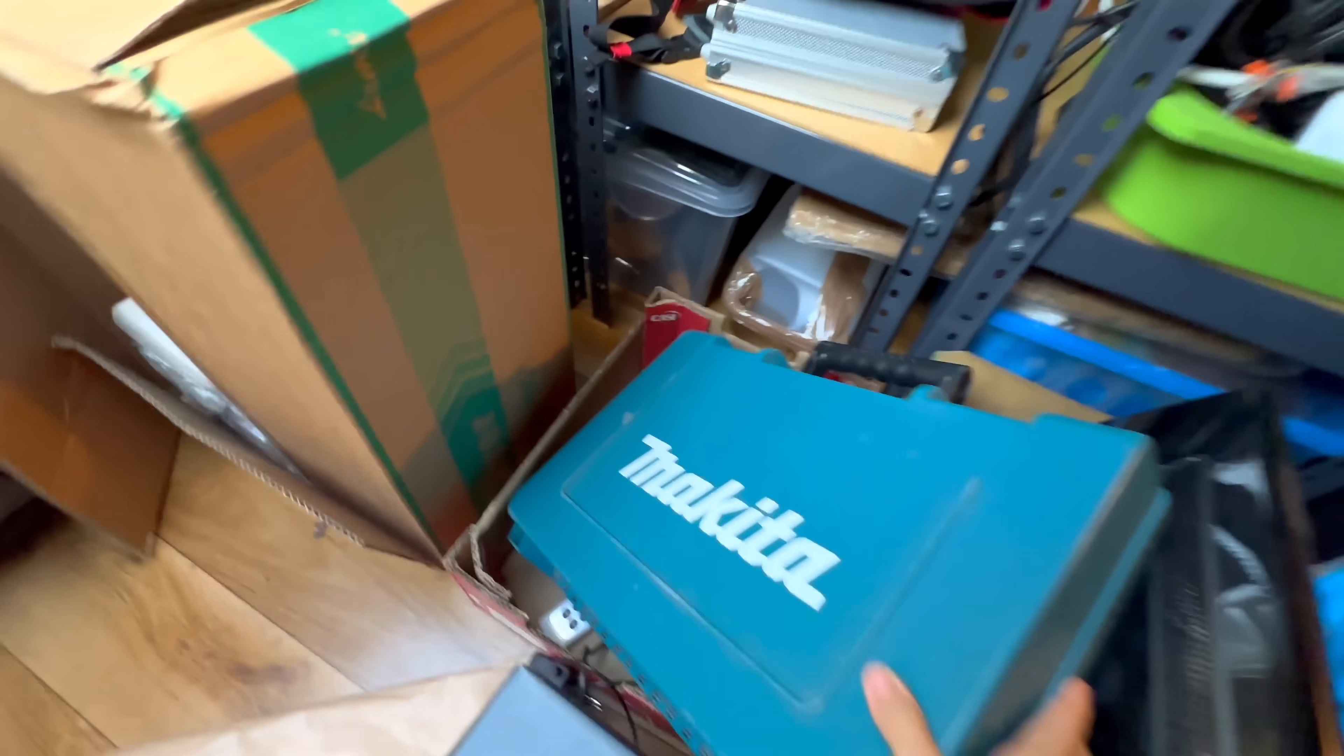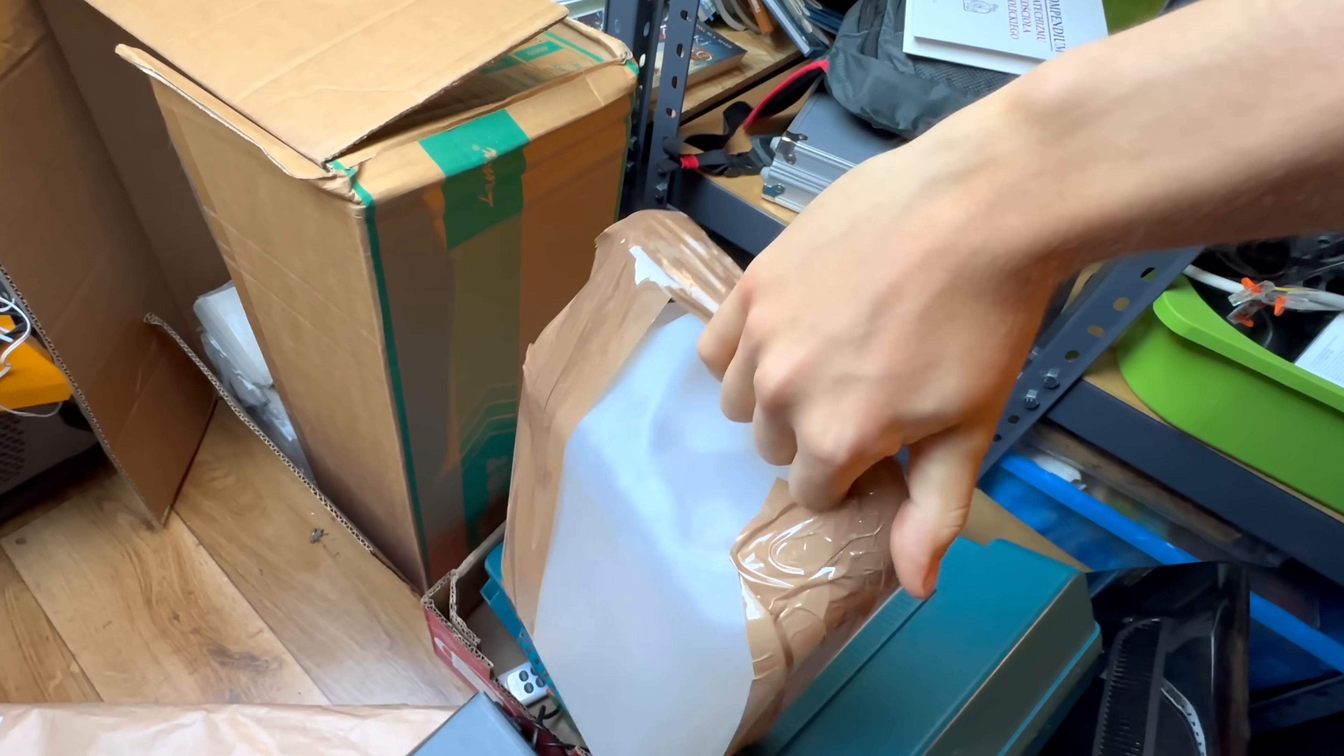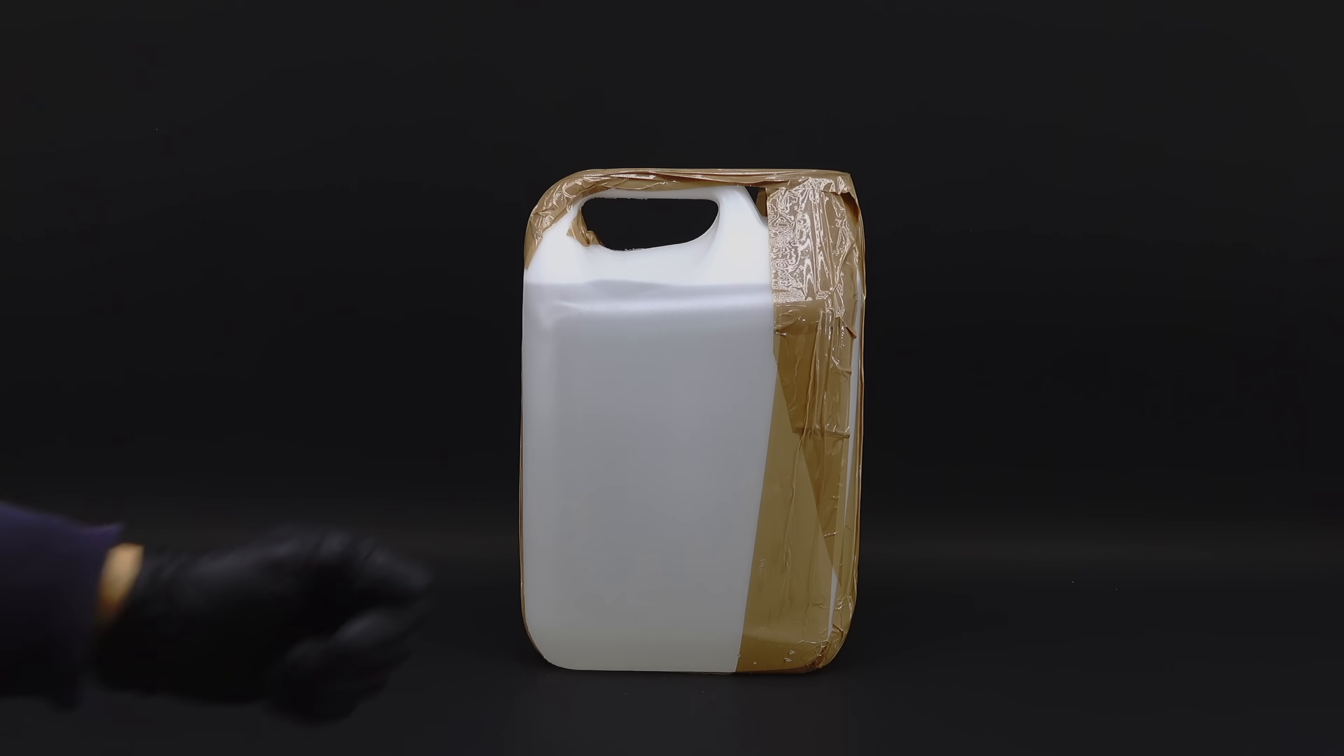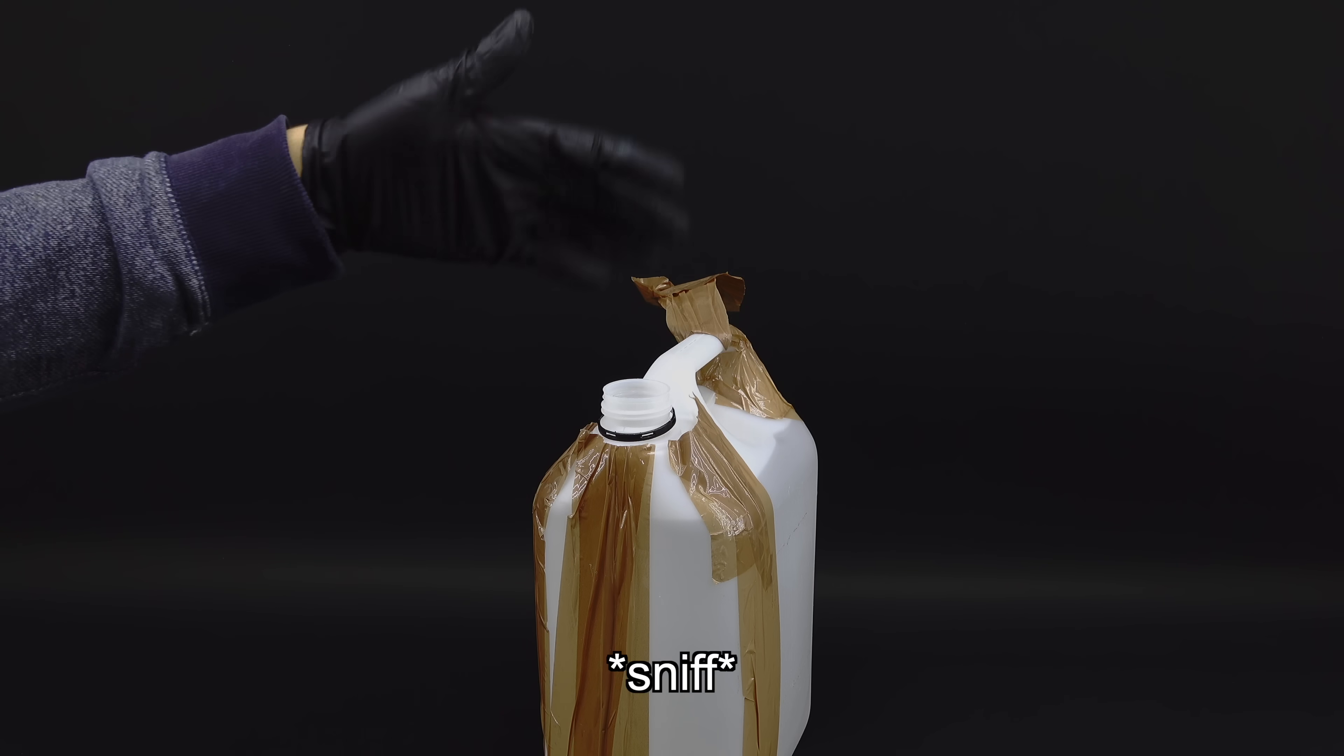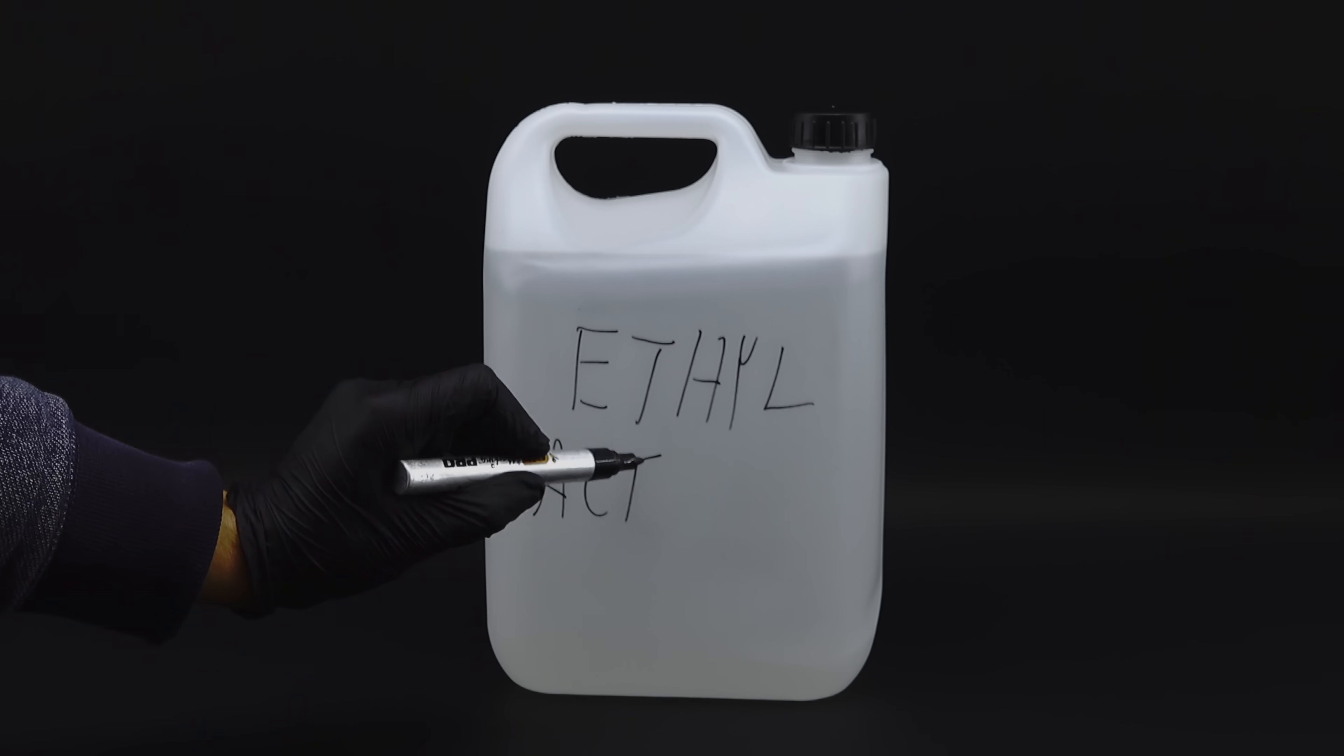This journey started about a year ago when I found this old unlabeled container in my attic. When I asked my dad what this stuff was, he told me it's just some industrial nail polish remover he bought years ago. I wasn't quite satisfied with that answer, since how often do you find 5 liters of a perfectly intact chemical just laying around, so I decided to do a little digging. After a professional smell test and some more technical analysis methods, I deduced that what I have is a chemical called ethyl acetate.